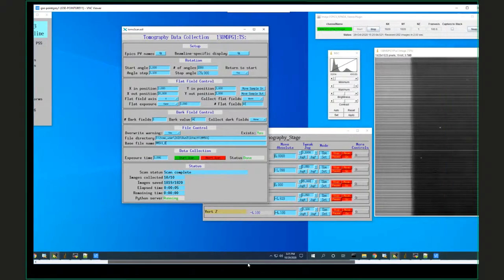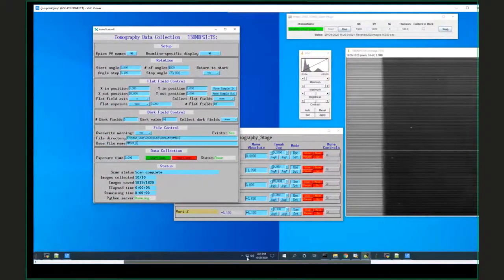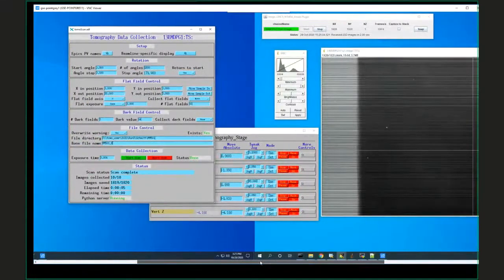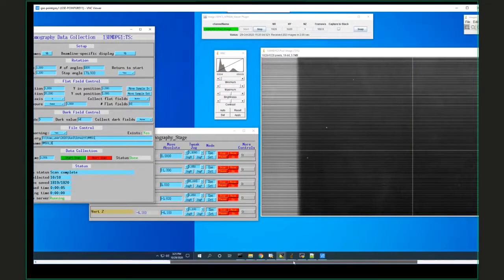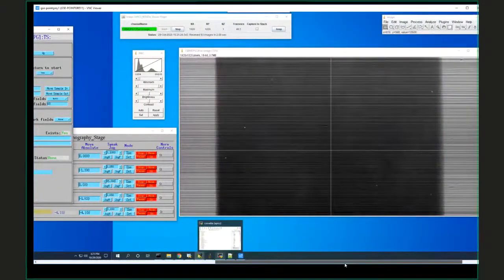Unlike on the big press that we do the high pressure tomography on, those rotation stages are really, really slow, and there's nothing to prevent it from spinning in one direction forever. There's no cable windup problem. So we don't return those to the start. We just do the next scan from the angle where the last one finished, because it's a heck of a lot faster. But for this, obviously the rotation stage is quite fast.